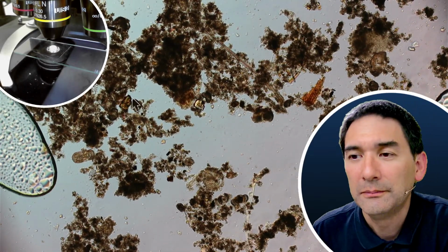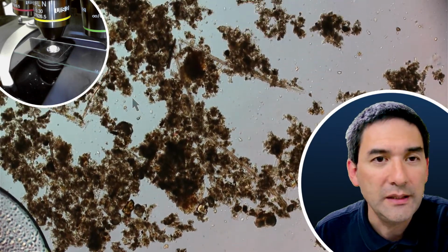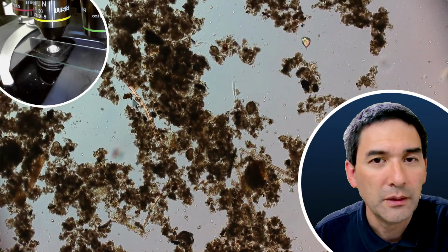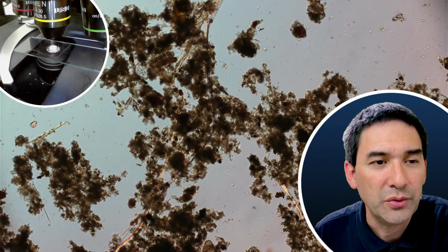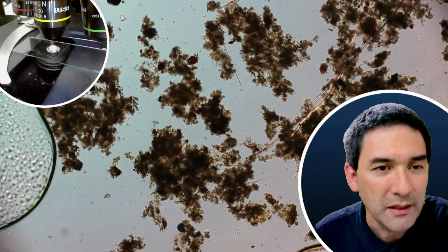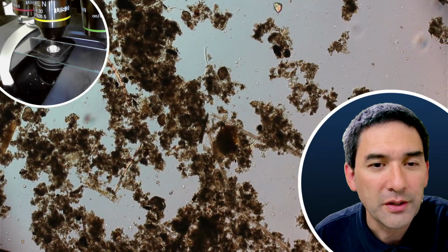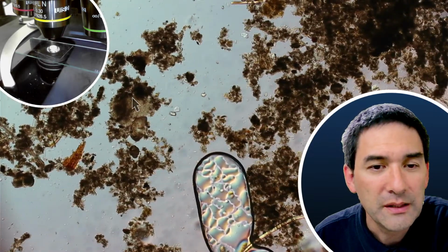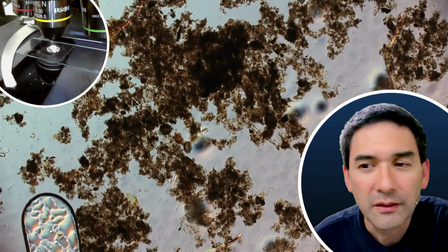So, you know what? I'm going to leave it at that. It's 1 hour 18 minutes already. Those microscopy sessions I always like to do in a way where sometimes even I myself don't fully know what to expect. But sometimes indeed there are some interesting observations. In other cases, there is less going on, but this still shows us something about our environment. Okay?